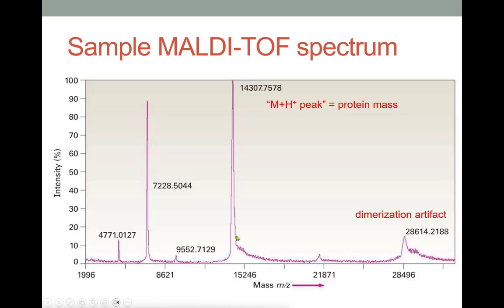And what this looks like is the same kind of format. We have relative intensity on the Y axis with the molecular ion peak, the base peak, tagged here at 100%. We've got mass increasing, m over z. The problem is that these molecules are so much more complicated, and so it's a little bit harder to read. It's a little bit noisier. But again, with computational help, we can do pretty well.